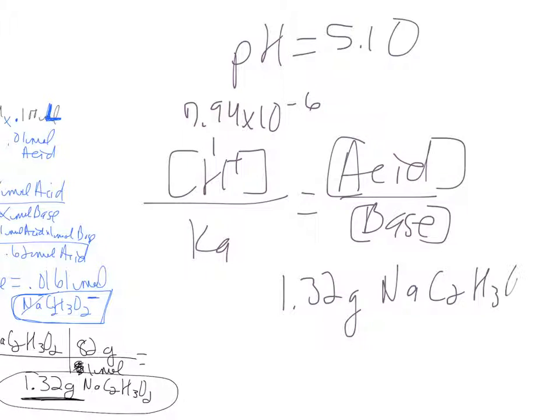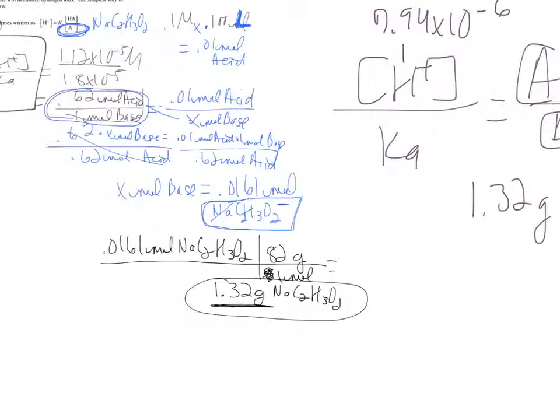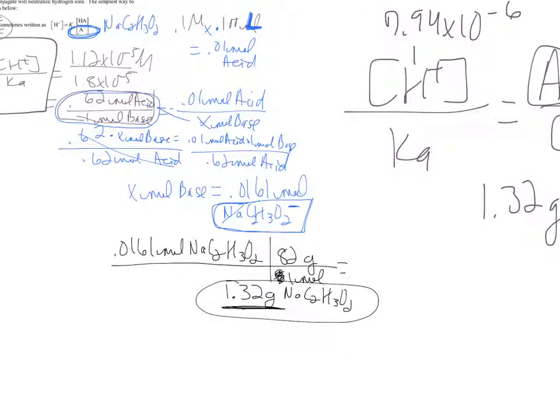The only thing you have to be careful of is on your third buffer, the one with the asterisk. It's the exact same setup, but you need to be careful that the molar mass is the molar mass of sodium hydroxide. That's the only difference. Your base is a strong base, not the weak salt base. And that's it. That's all you had to do to calculate, and then you just made your solutions, and then I would check with a pH meter. And that is the lab.